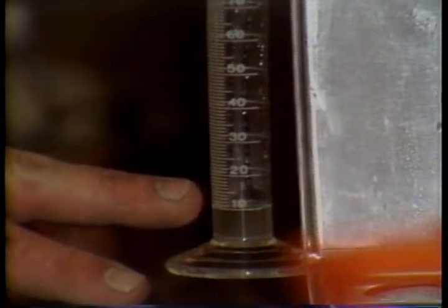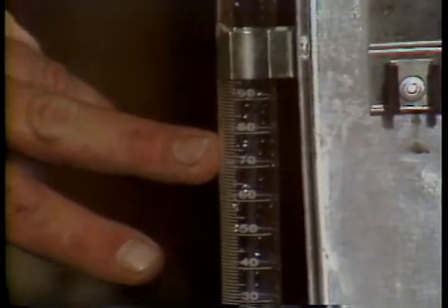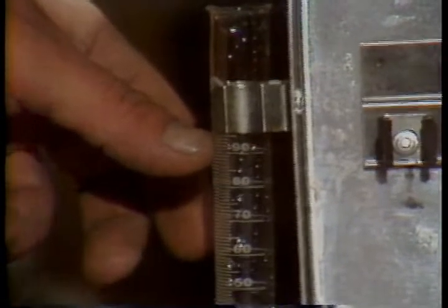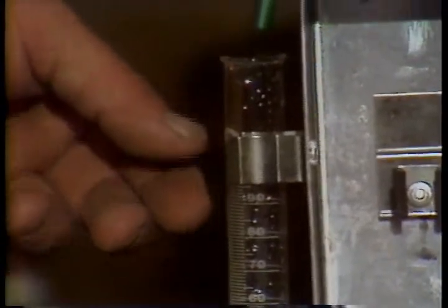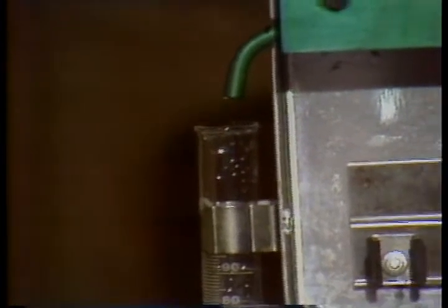As you can see, she's beginning to cook off already. And we'll have our water content on the bottom. If there's any oil in the mud at all, it will show up on the top part of the water. We should have somewhere in the neighborhood of 4 to 5% solids in the mud, which will be the void spot at the top. That'll be our undesirable solids that our mechanical equipment has not taken out of the mud. The liquids are measured in a graduated flask after all of the condensation stops, usually about 30 to 45 minutes. The solids remain in the container.